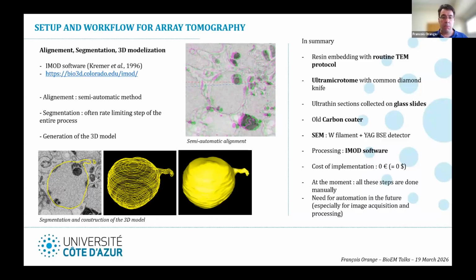In my plan, possibly in the years to come, I will try to find software which will do the segmentation more or less automatically. But I think I will stick to the alignment tool of iMod because it's very powerful and quite easy to learn and to master.